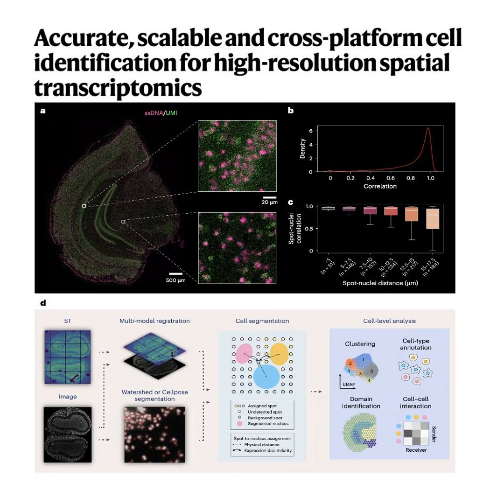So if the algorithm actually segmented a single real cell correctly, pile A should genetically match pile B. Exactly, because theoretically, they originated from the exact same biological source, and Cellist scored the highest on this metric by far. Wow. And they also used a variance-based purity score. Yeah. This compares the internal gene variance of the cell boundary Cellist drew to the variance of the surrounding neighborhood. Basically checking if the inside of the cell is genetically pure compared to the chaotic noise right outside its border.